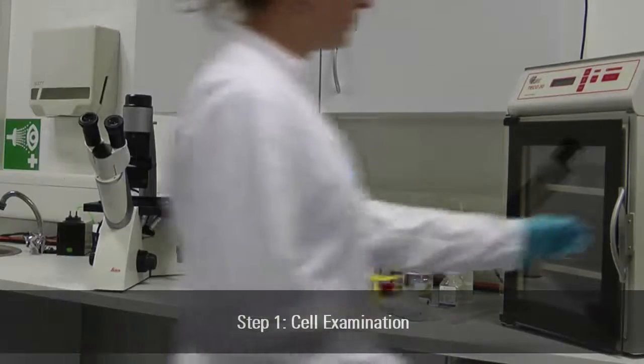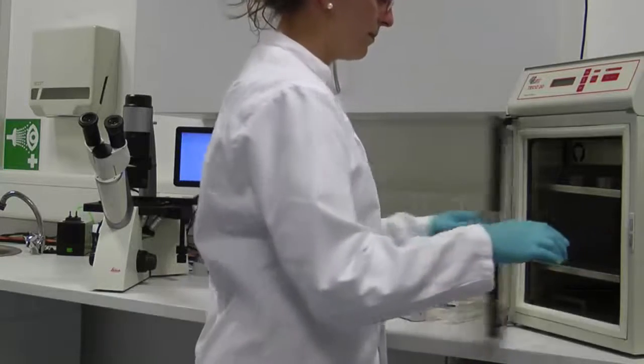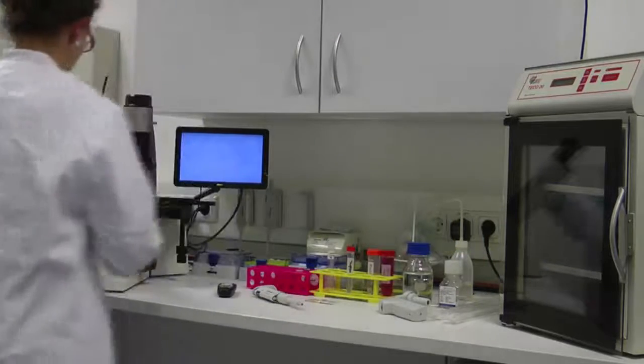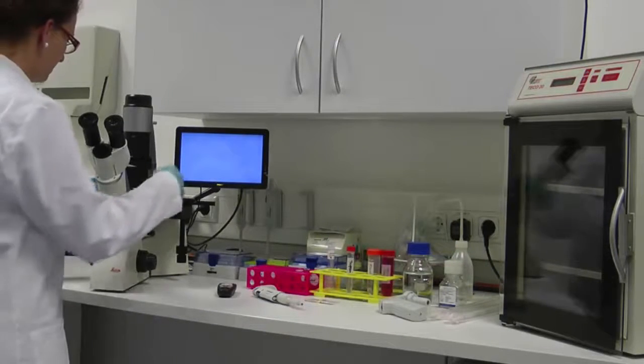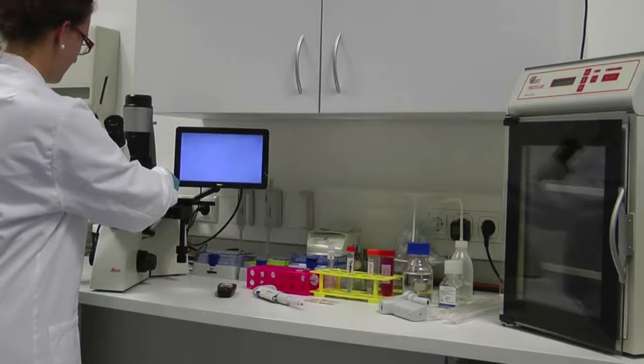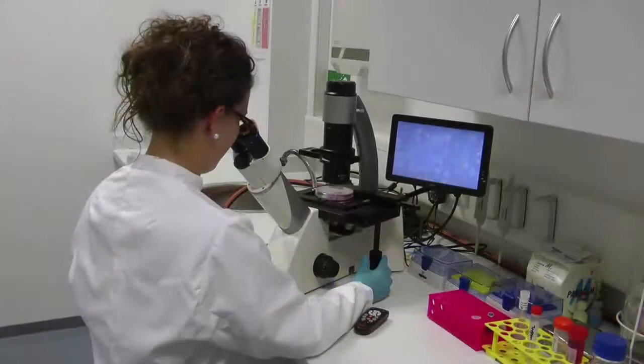Take cells out of the incubator and put them under the microscope for quick cell check. Cells should be checked microscopically every day to ensure they are healthy, that means no contamination and only a few dead cells and growing as expected. Cells should be mainly attached to the bottom of the dish or flask and the media should be pink-orange in color.